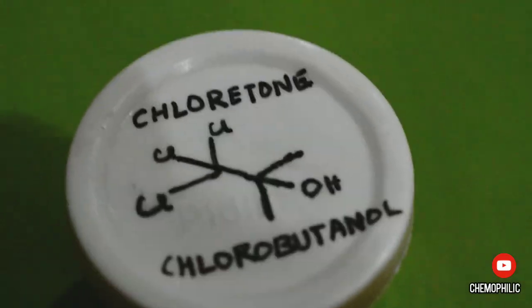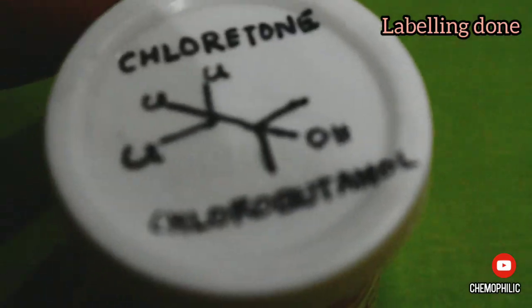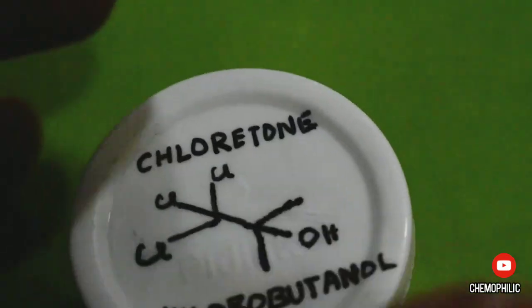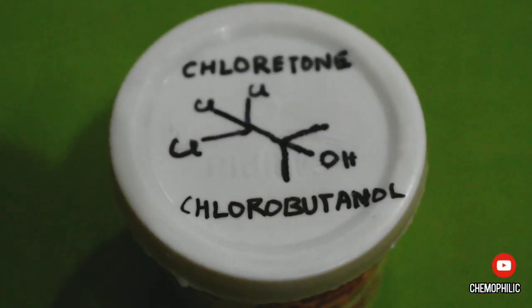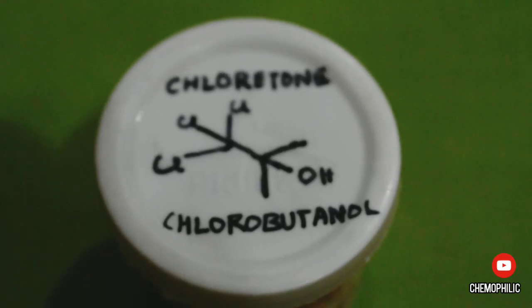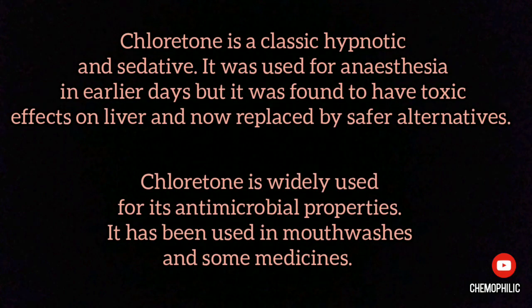Chloritone has a higher vapor pressure so it sublimates out in room temperature and must be kept in cool places to avoid losses. Chloritone was used as a hypnotic but it has ill effects on liver and is now replaced by safer alternatives. It is also found as an active ingredient in mouthwashes and some medicines for its antimicrobial properties.